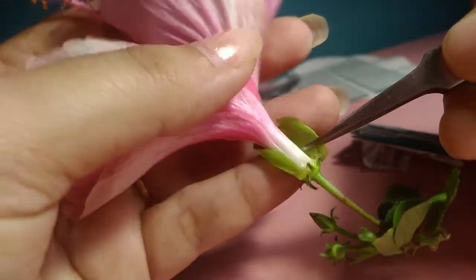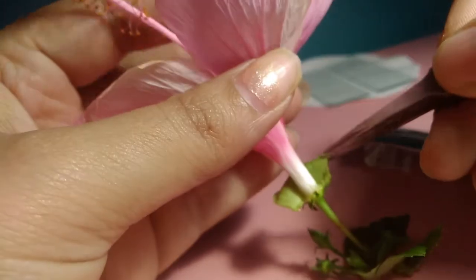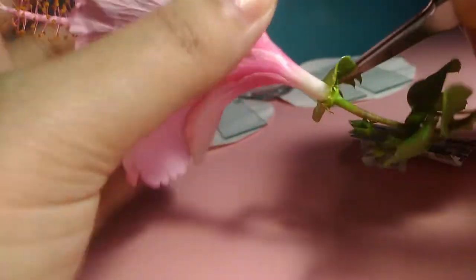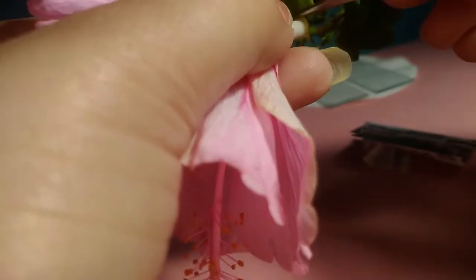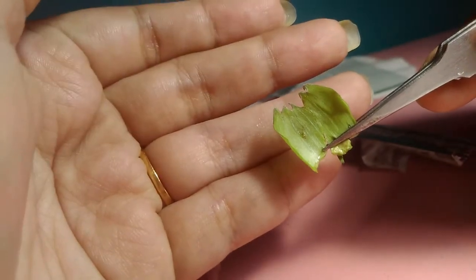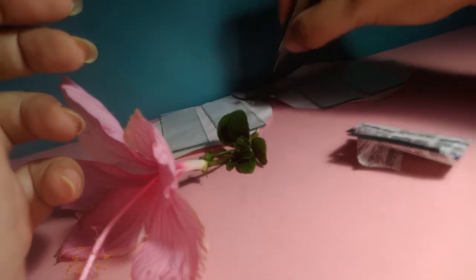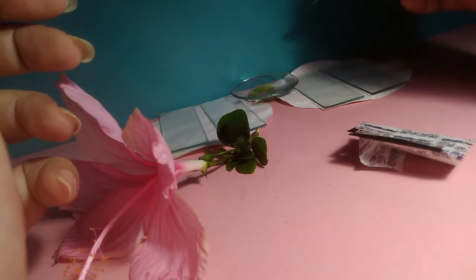I am trying to gently remove this calyx from the flower. Yes, it is here. We have our calyx just here. Now I am going to place the calyx in our water for some time. Remember the watch glass that we had taken? Yes. So I'm going to place it there.